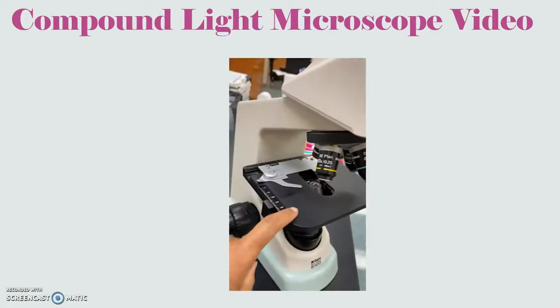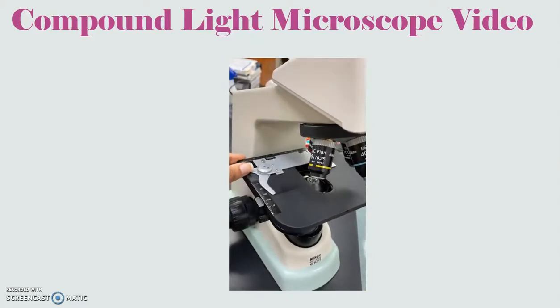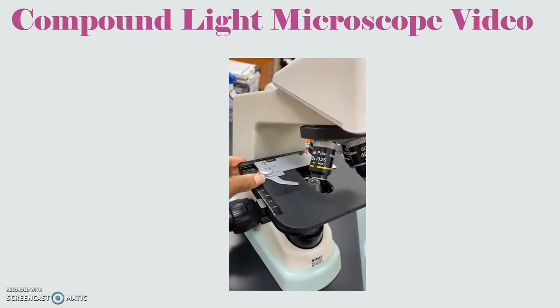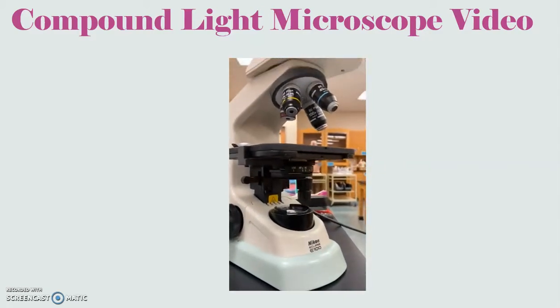Okay. This is your mechanical stage. This entire black structure is your mechanical stage. And this silver lever is what's going to lock your slide into place. So if you give me 1 second, I can show you that.